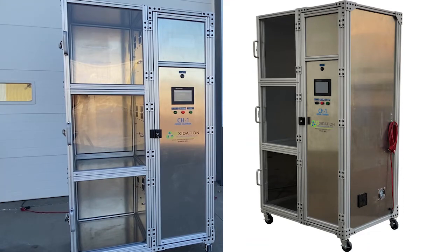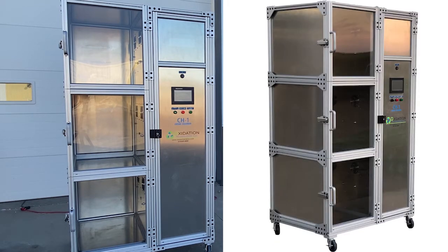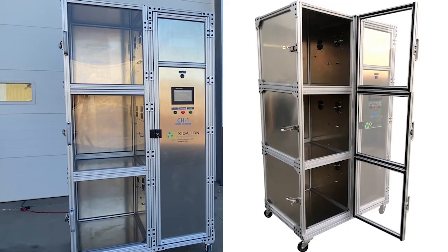This is the CH1 ozone test chamber. It is specifically designed to comply with the ASTM standards for testing materials. This one in particular is a custom build designed as a three-chamber-in-one complete system. Each chamber can maintain and control ozone and temperature levels at a given period of time. Electrical power is the only requirement to operate the CH1 test chamber.